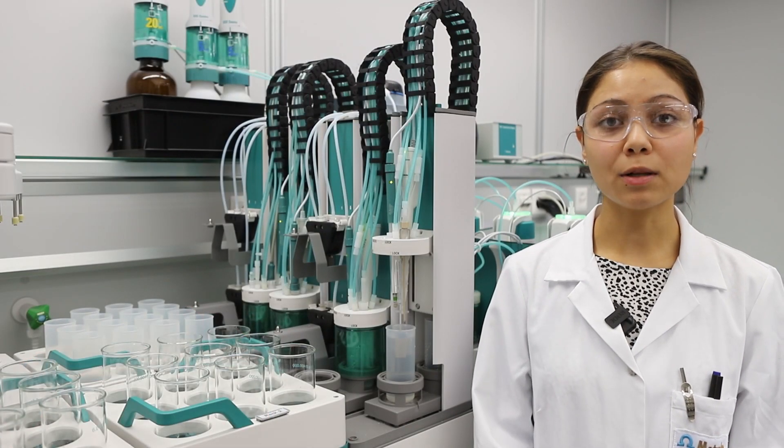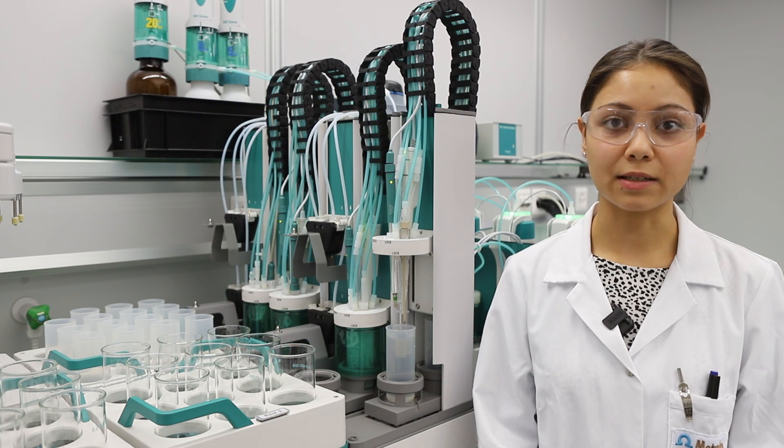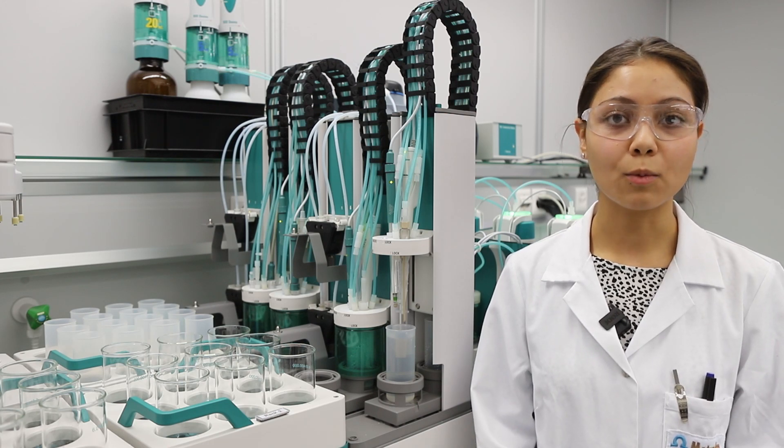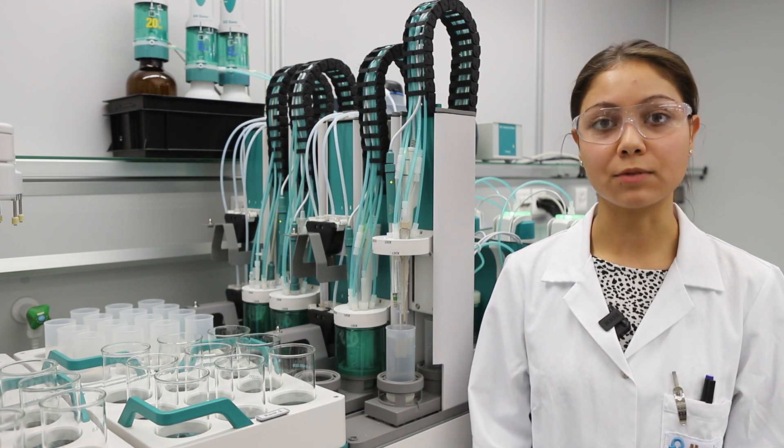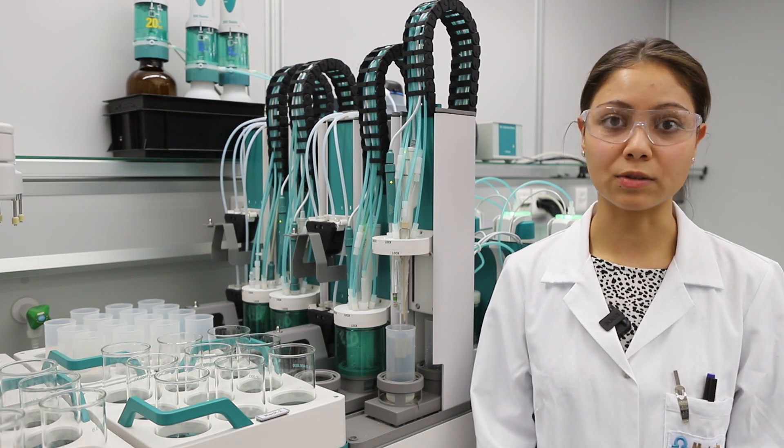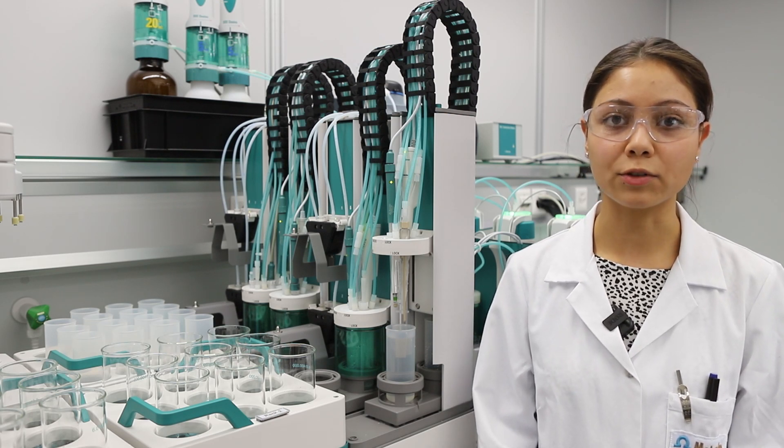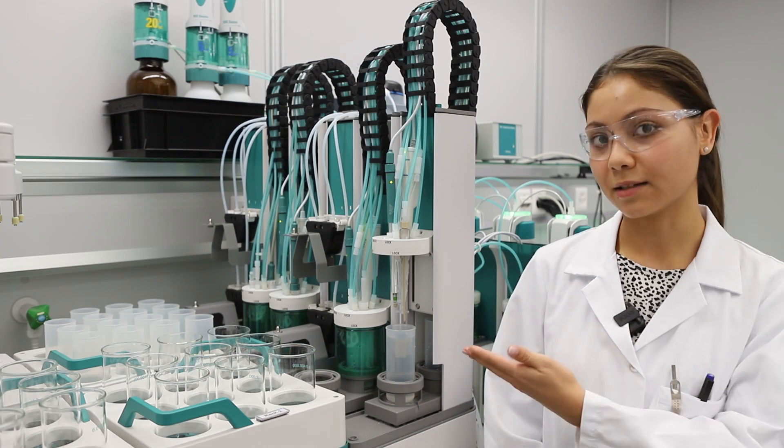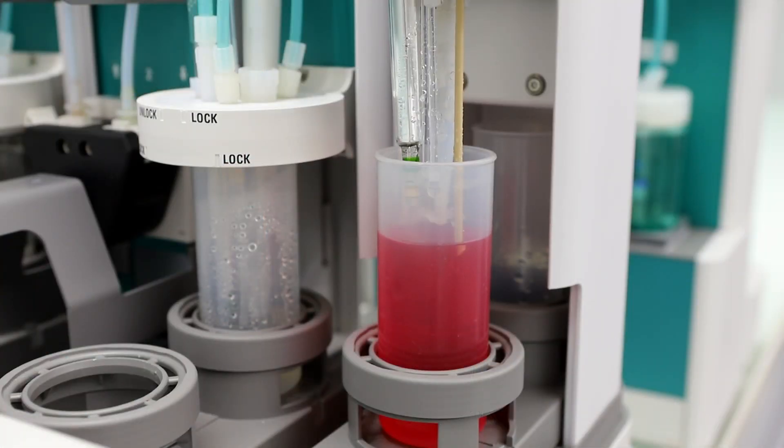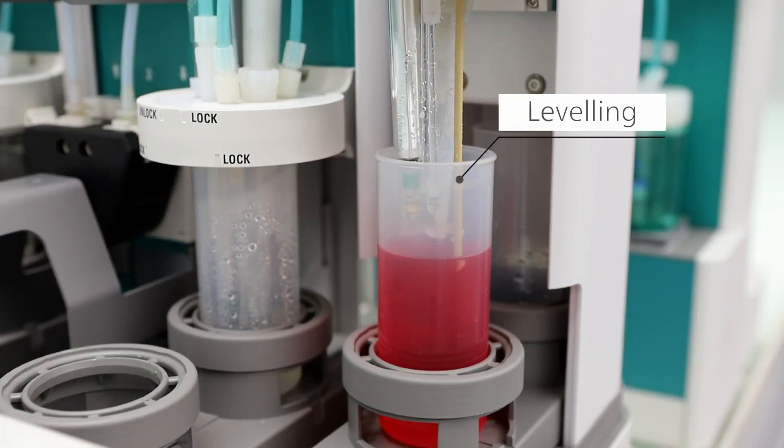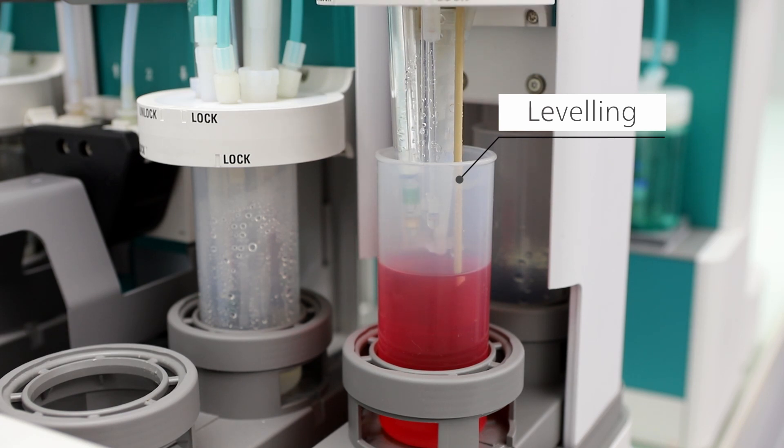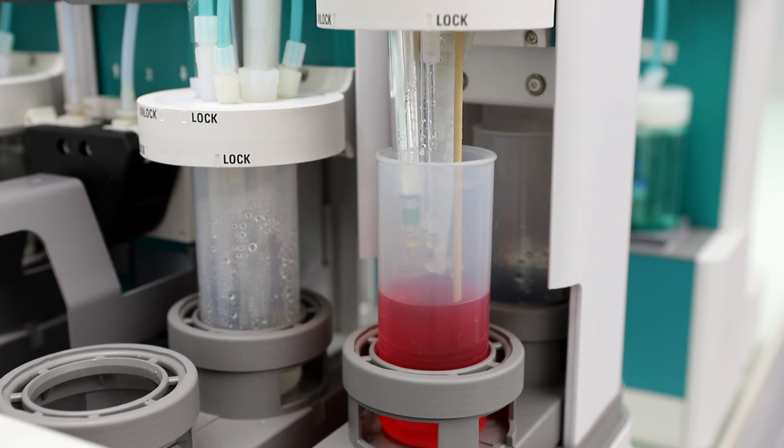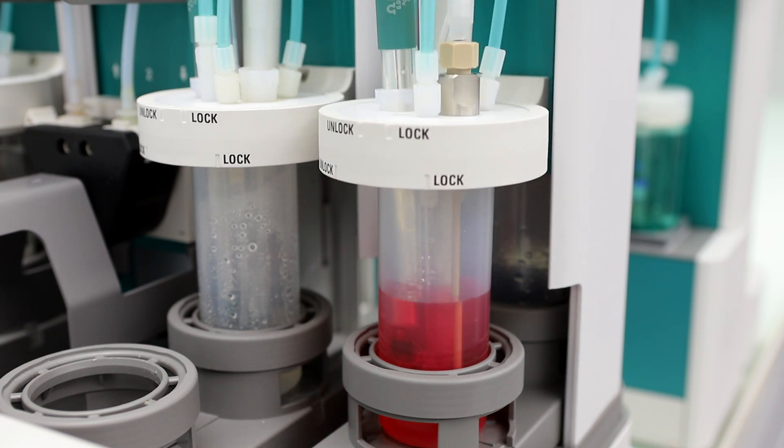If you have a sample which you don't want to aspirate in your cylinder unit, for example wastewater or samples with particles, then you can also use another option to set your sample volume automatically by using levelling. With levelling you aspirate your sample from the surface going step by step further down with the titration head. This is a very fast alternative to the transfer via cylinder unit shown before.